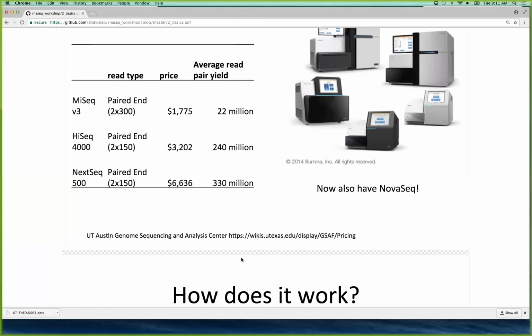Well, it's funny because your projects are poster children for wanting longer reads. Right. So I generate longer reads for a lot of my projects as well. If you don't have a reference genome, and you have to assemble your transcriptome from scratch, it's much easier to assemble it from bigger pieces.